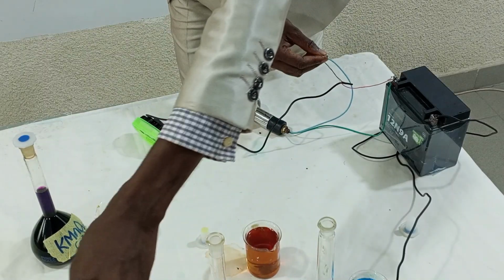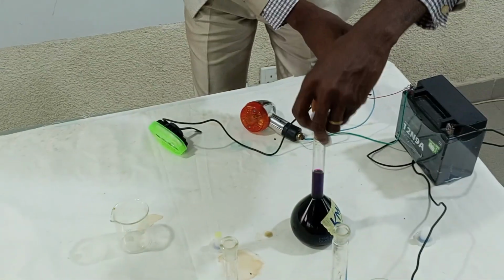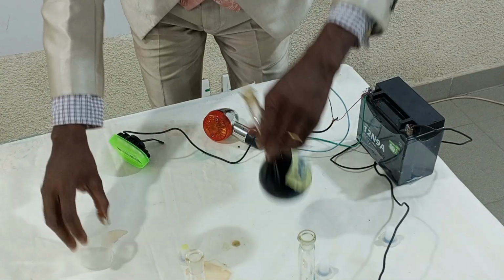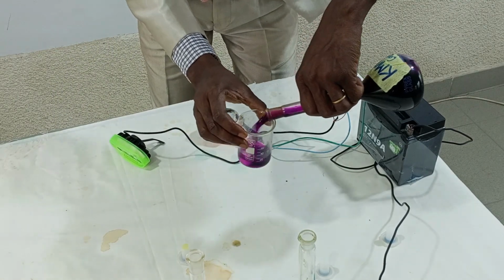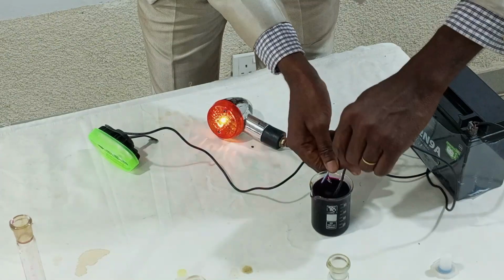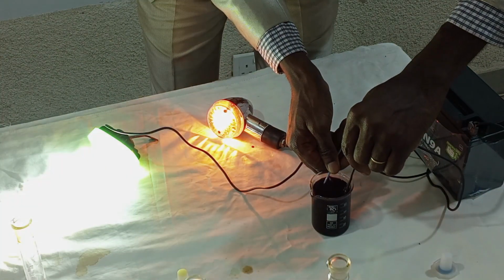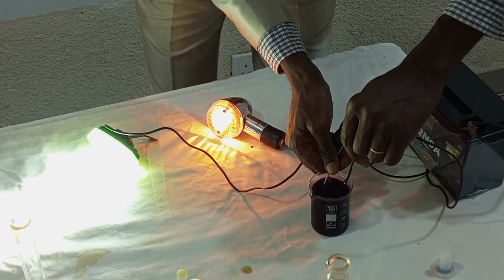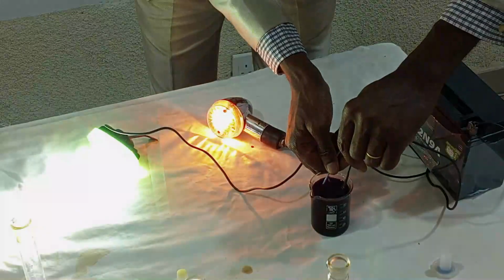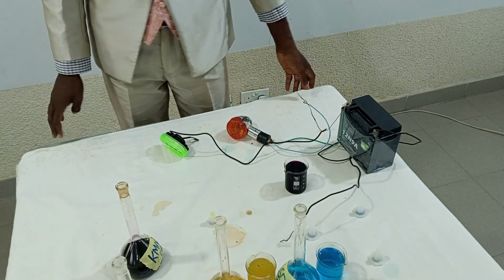Now let's check the potassium permanganate. This contains potassium ions and MnO4- anions. So let's see. See? It produces light because it contains K+ and MnO4- anions. So most of the salts that we have contain ions, positive charge and negative charge.